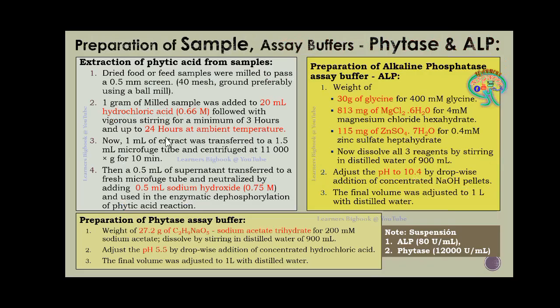Now further, in the next slide, it is the preparation. So here we are discussing the required materials preparation, that is the sample, assay buffers, phytase and ALP.